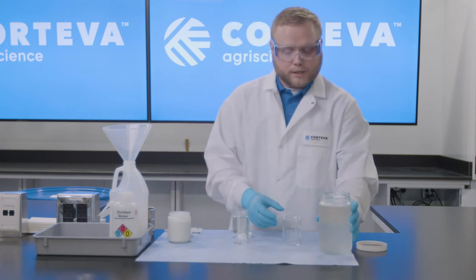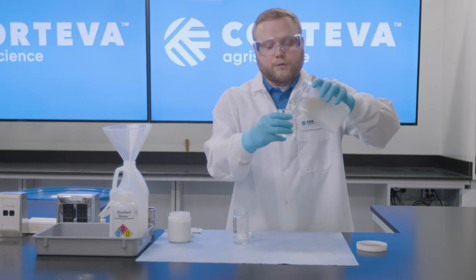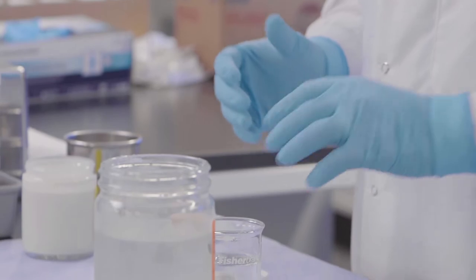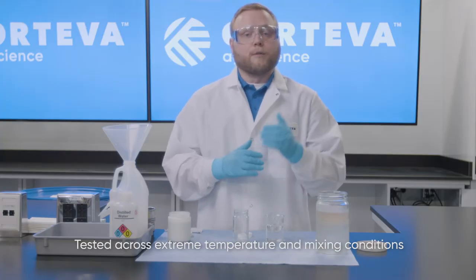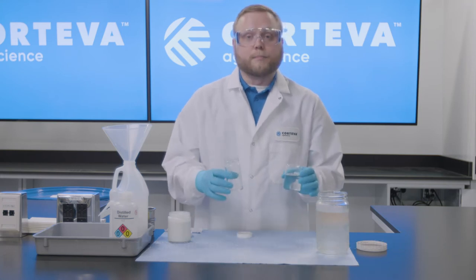We're going to do what's known as a standard jar test. For that we're going to pour 100 milliliters of UAN 32 into a beaker. Because we know that products are not always added to the spray tank with the full amount of fertilizer in the tank, we're going to start our test at a 50% volume.